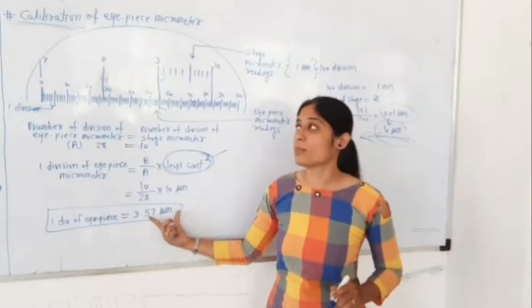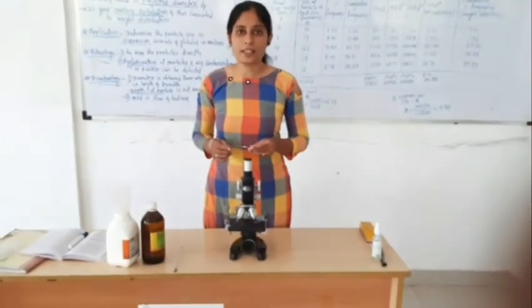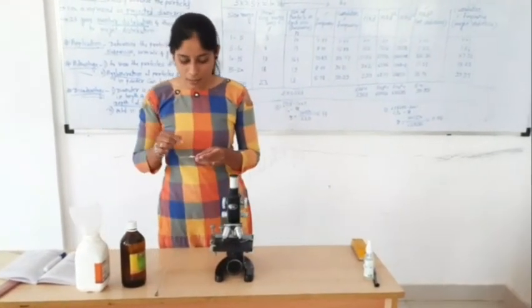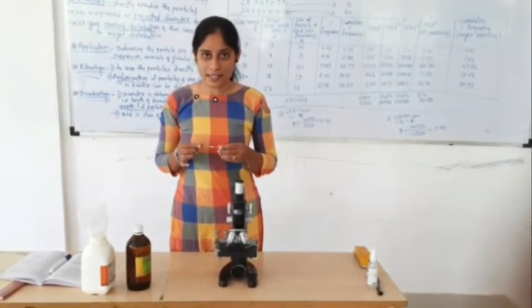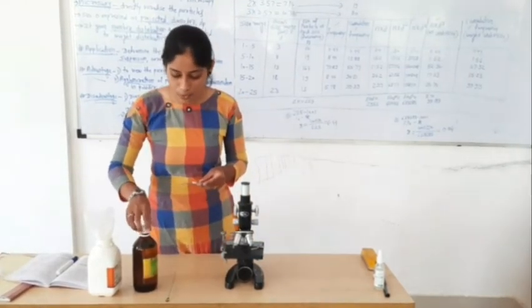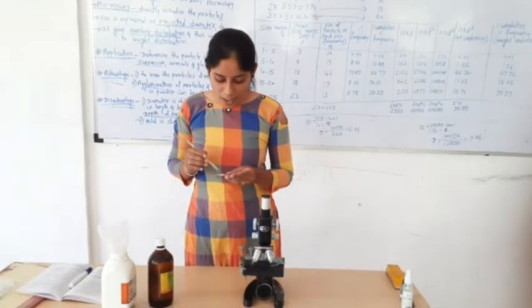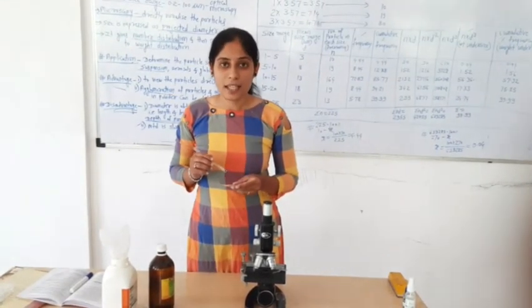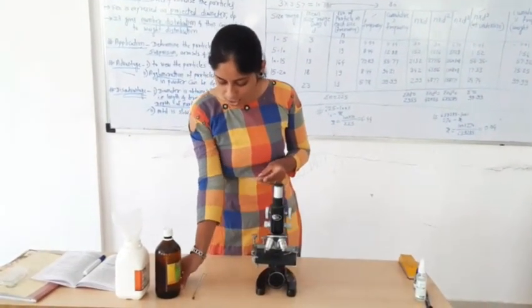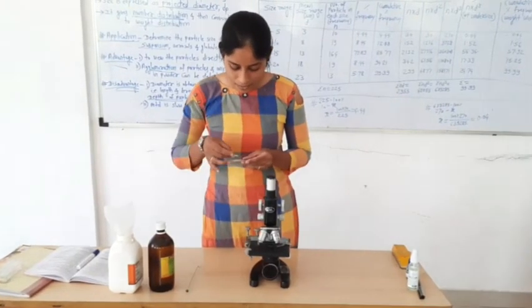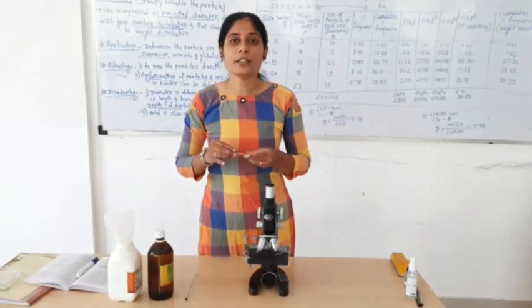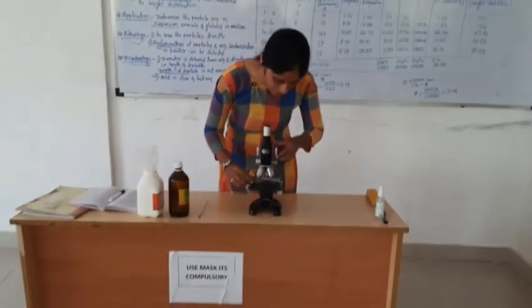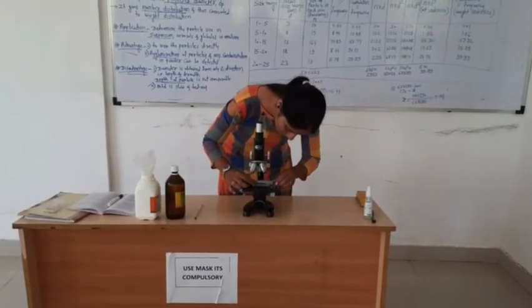The next step of the procedure is mounting of the sample. Take a small portion of the powder sample — here we use a starch powder sample. Place a very small portion of the starch powder sample on a glass slide, then add 1 to 2 drops of liquid paraffin on the powder. Mix this mixture uniformly on the glass slide, avoiding entrapment of air bubbles. Apply a cover slip on the surface of the powder sample, avoiding air bubbles, then place the glass slide on the stage.